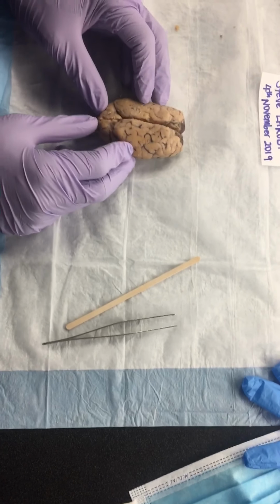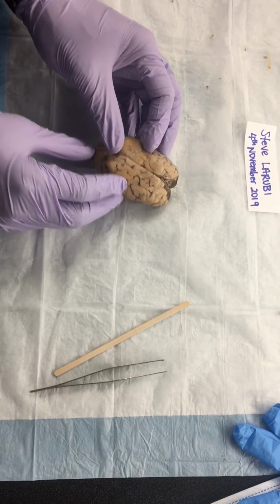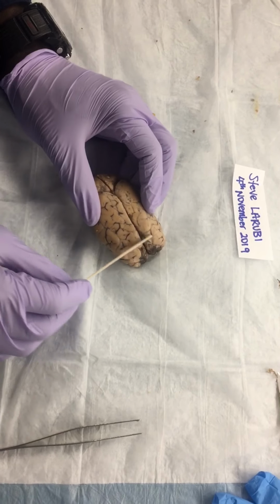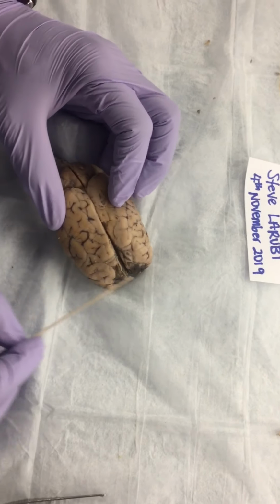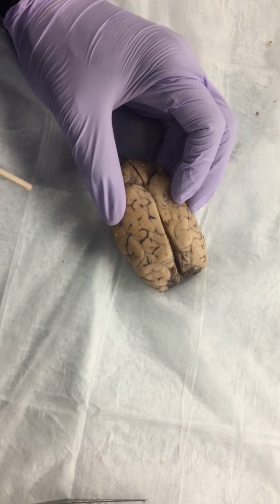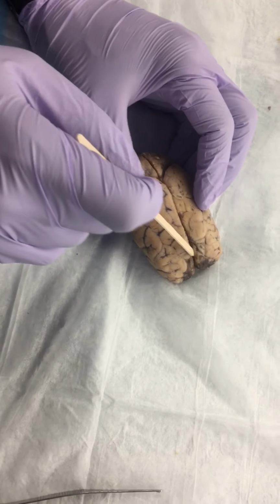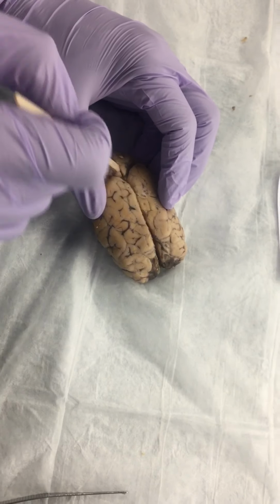So today I'm going to be talking about the sheep's brain. With the sheep brain, as you see right here, it's a general orientation. In this area right here, that's the cerebrum. It's the largest part of the brain. It has two different hemispheres, and it's separated by the longitudinal fissure right here. It runs up and down.